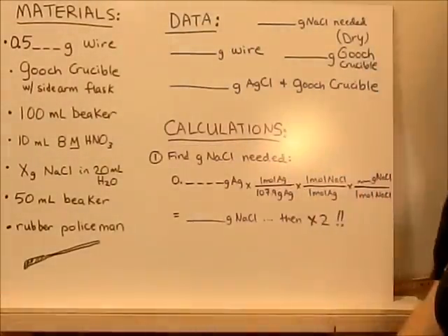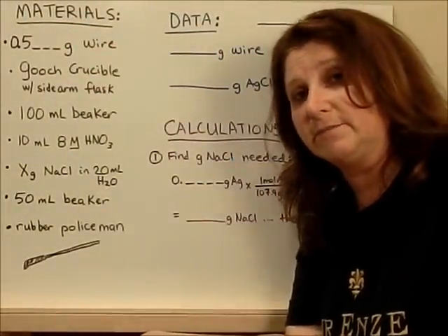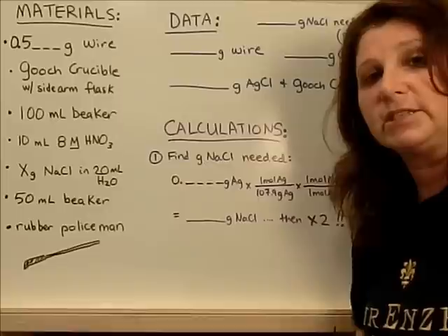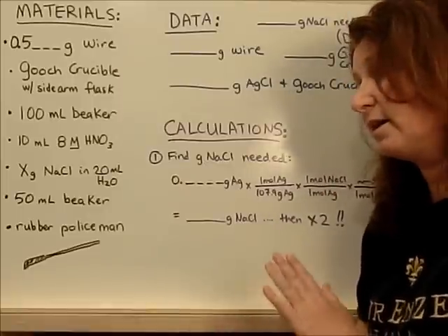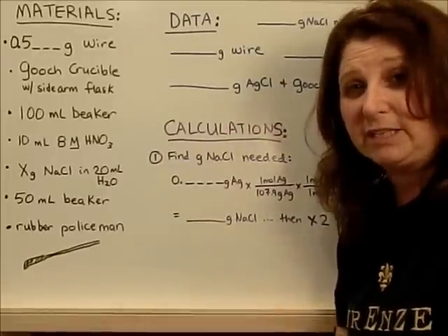But now you do. So here's what you're going to need. You're going to want to write down your materials list, your data, and then here's your calculations. I will talk through it, and then I'll give you a chance to pause and write this down. And there's one more page of calculations to do.